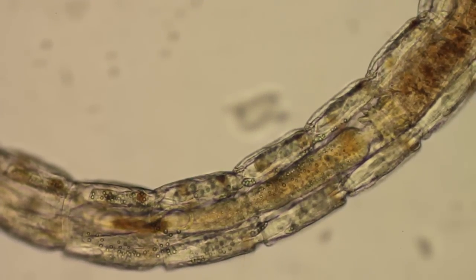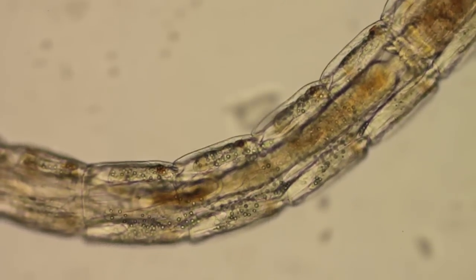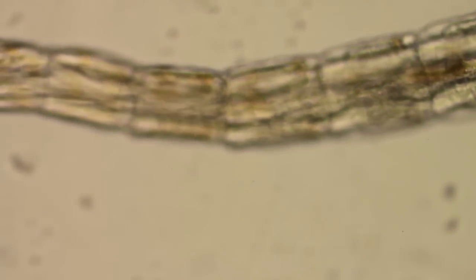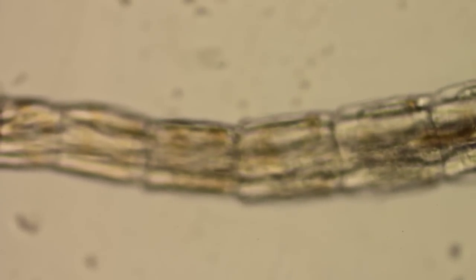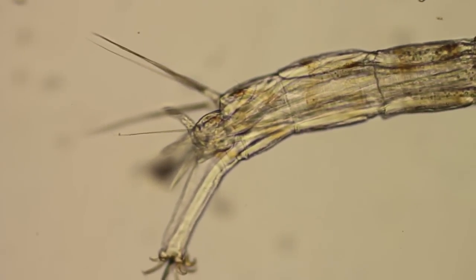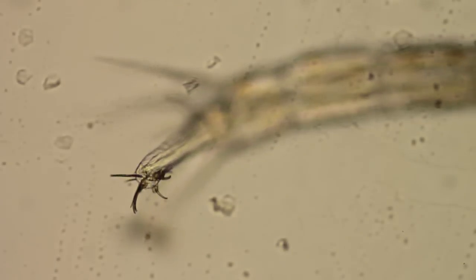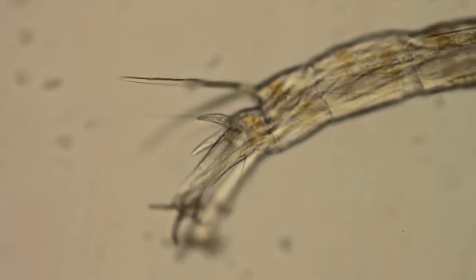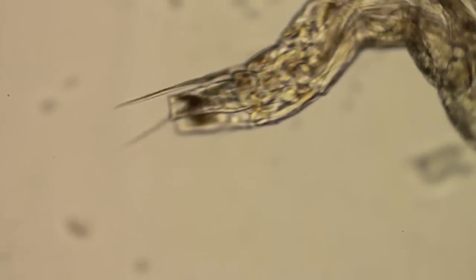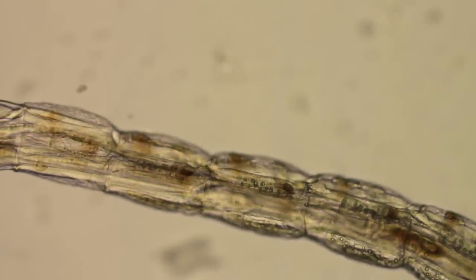Now we're on a 10X. The green dots in there — that's his blood. You can see each section has a bladder; I think those are for buoyancy. I've seen these bladders in other midges, but not exactly like these. Look at those claws — he can clench those. And there are little horn spikes there for whipping his enemies.